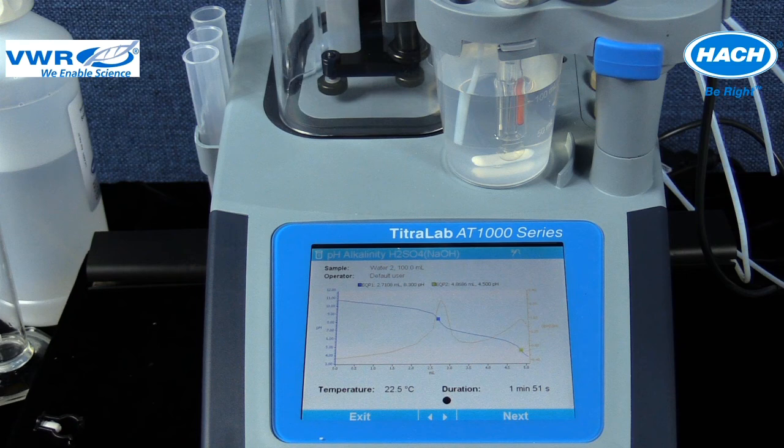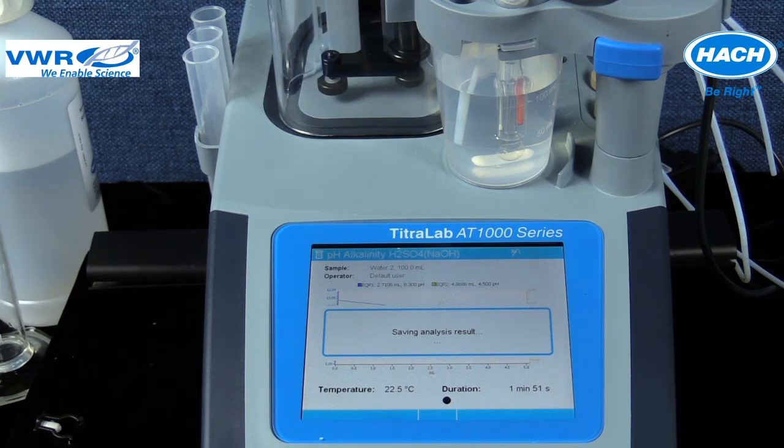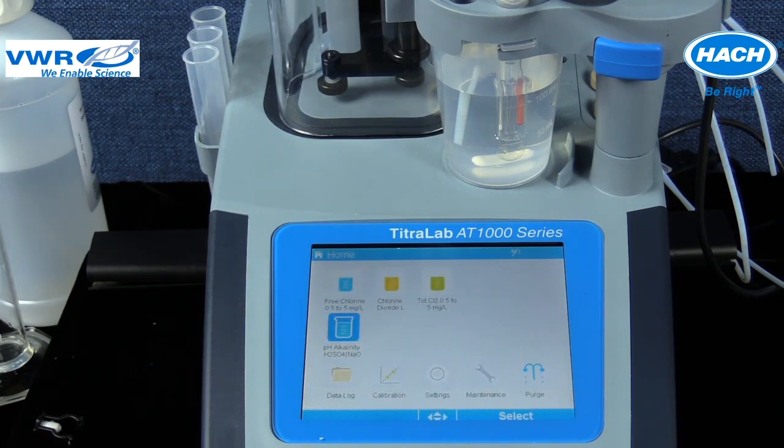If measuring more samples, the next button can be selected. If there is no other sample to be measured at this time or using this application, then exit can be selected. Once exit is selected, the software will display that the analysis results were saved and will return to the home screen.